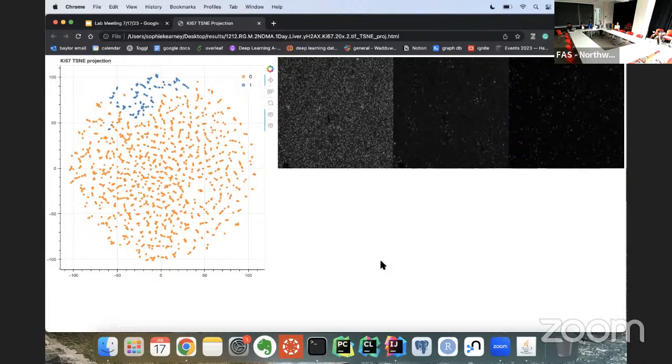And then you do a quantification here, right? So you can treat the features that you get out of the TSNE as your readouts, whatever the size of that feature. That is similar to what Mariabel gets out of an experiment where you get this 500,000 readout.